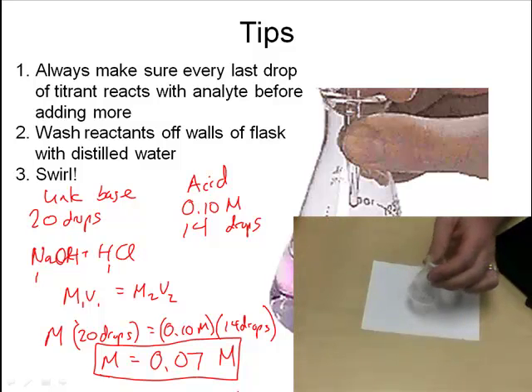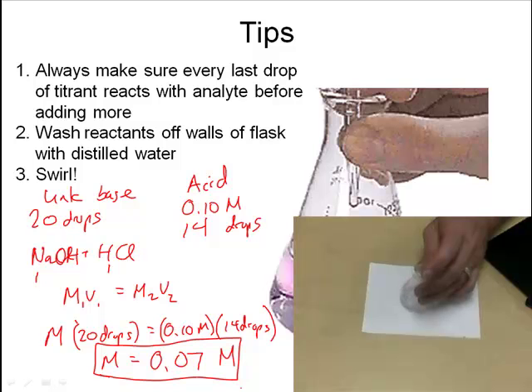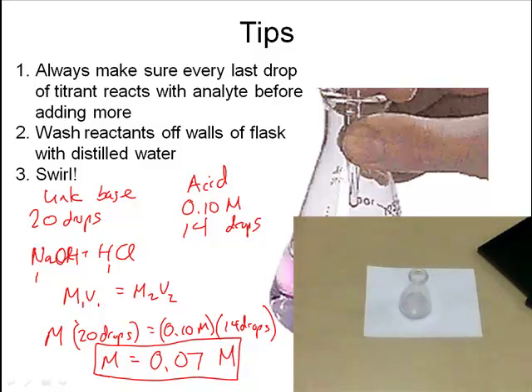So tomorrow we're going to be using burets and buret stands to find out more precisely the measurement of an unknown base, like this one here, that might have a different concentration. So that is our challenge. That's how to do a titration.